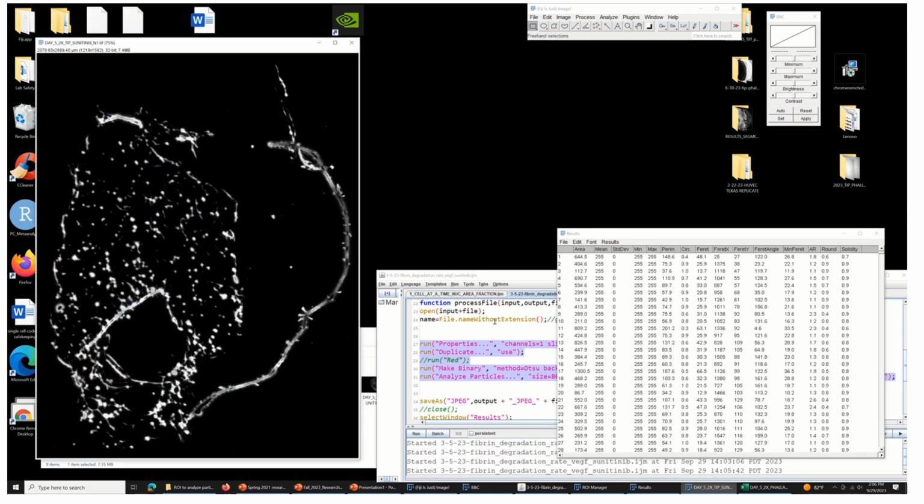If you're good at coding and good at Fiji, then you can automate the folder function for this. But I was having trouble getting a couple of things to save, so I haven't automated that yet.